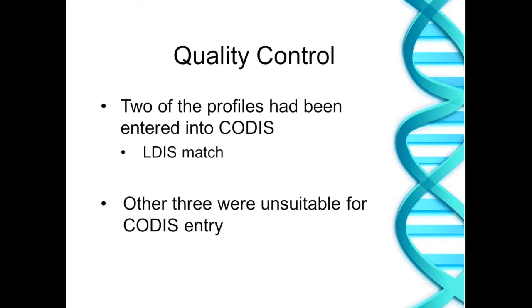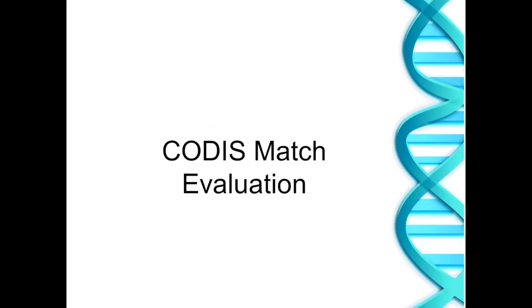Especially if you have all your lab workers and all your crime scene investigators in a staff database, because then you're comparing every piece of your evidence data to the staff database and not just the pieces that you selectively enter into CODIS. And it works that way for lab quality control as well. Maybe if there's an event that happens in your laboratory that you don't know about, you can identify it through the databasing process.